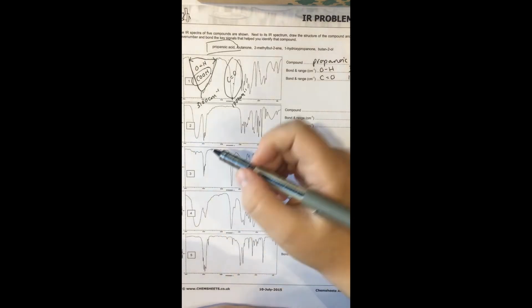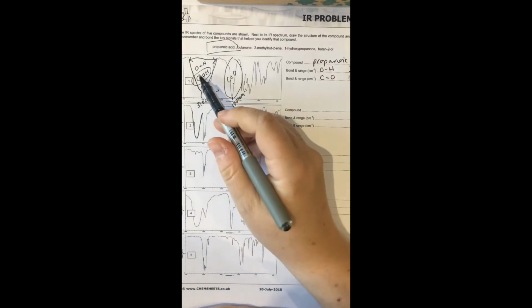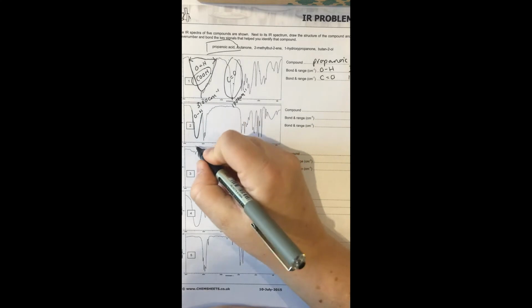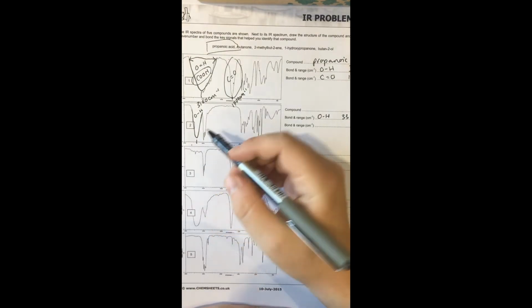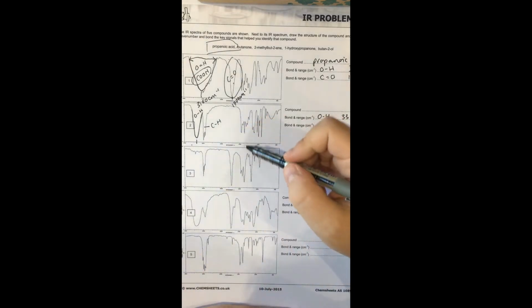Next one down, number 2, interesting peaks. We've got this one, which is an OH group. See how it's less broad than that one. So that's an OH in an alcohol, and you can also confirm that by looking at the wave number. It's slightly higher. So we're now at 3,350. This peak next to it is our carbon-hydrogen bond, so we don't care about that.